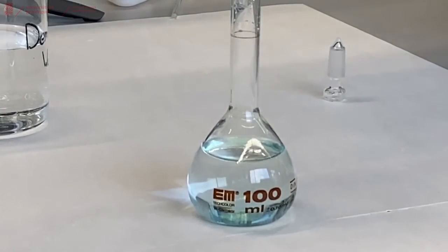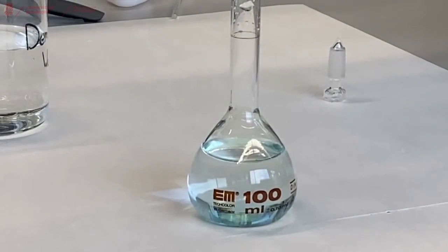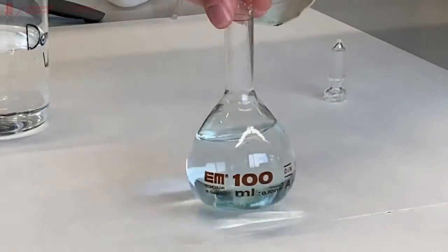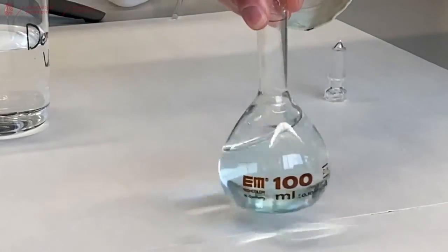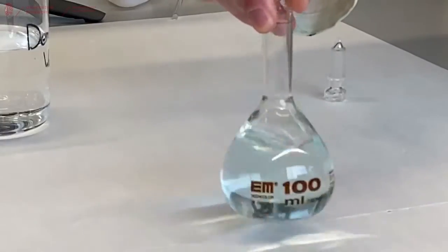When there's sufficient liquid in the volumetric flask, remove the funnel and gently shake to dissolve all of your compounds into your solution solvent.